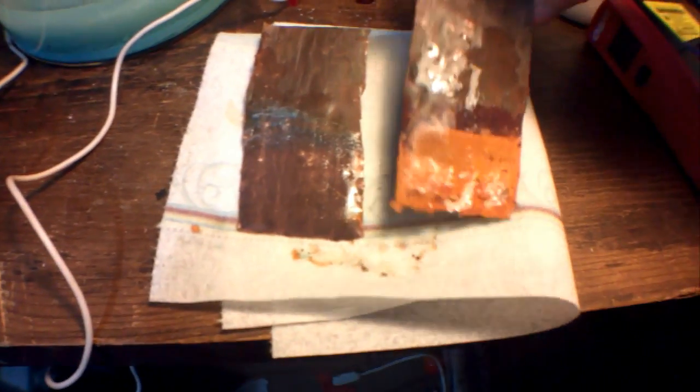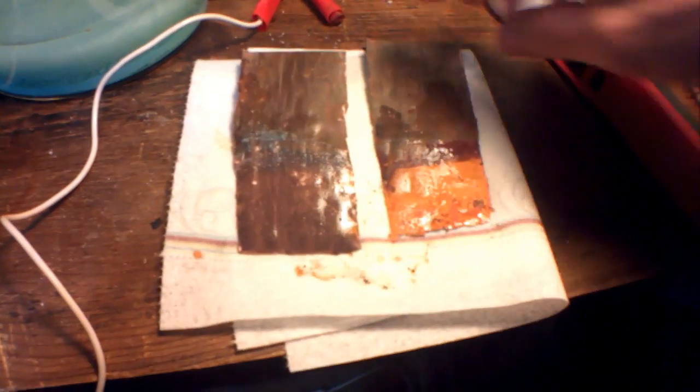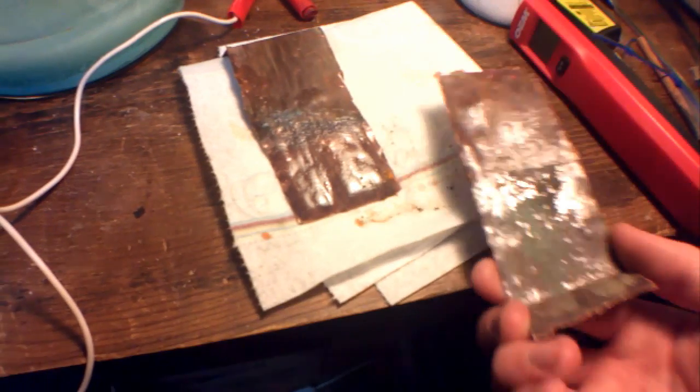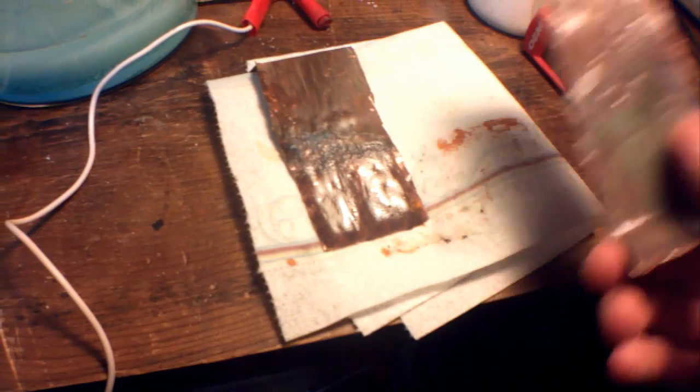Here we have the cathode and anode, and as you can see they're quite changed by the reaction. These two sides were facing each other, so that was where the least resistance was—that's where most of the reaction happened.